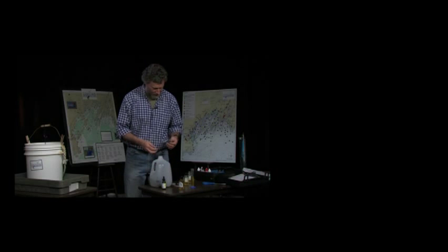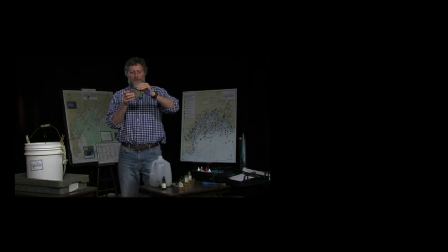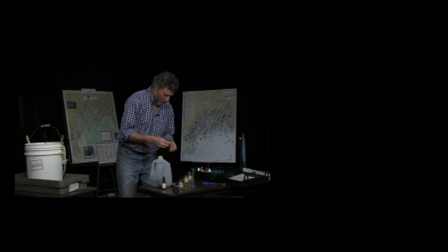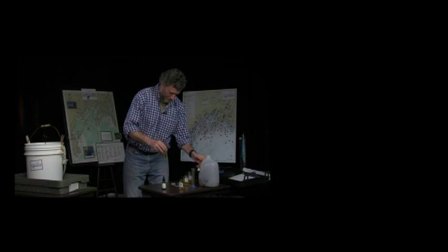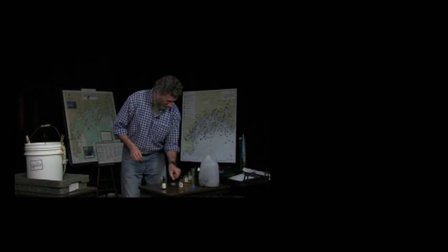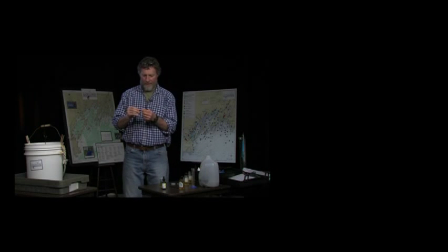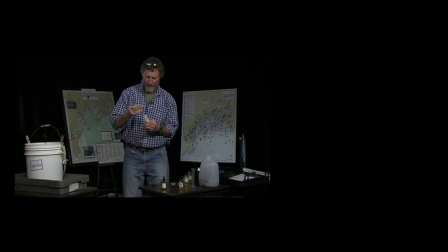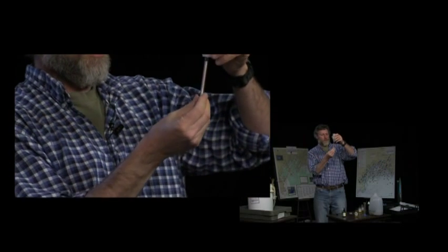So we've rinsed that 3 times. We're now going to take our 20 mils from here that we've poured out, and we will put that in there. We'll put the cap back on. The next step, again, is to fill our syringe or titrator, and we're going to use the sodium thiosulfate. And we'll put that firmly into the top.